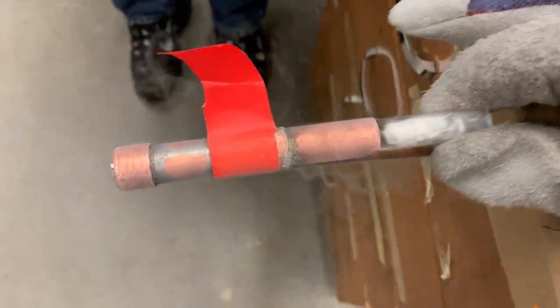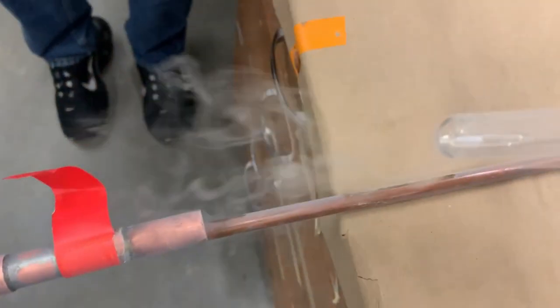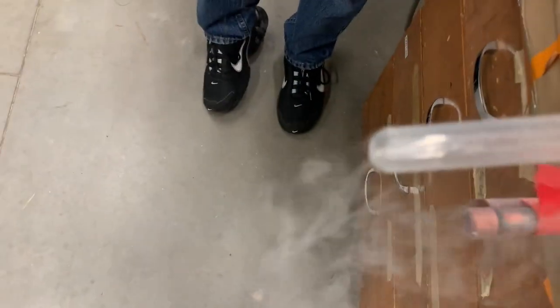Let's pull it out and see what it looks like. Oh, there it is! There it is! Whoa! Whoa! Whoa! The camera didn't... Look, you can see it!